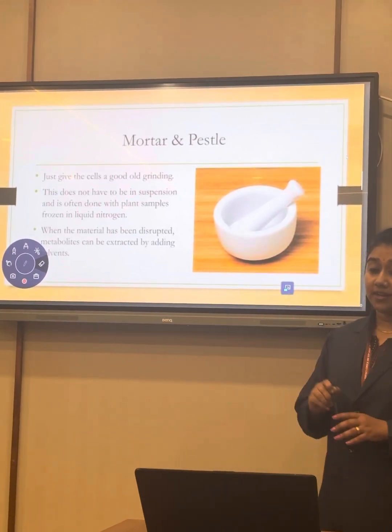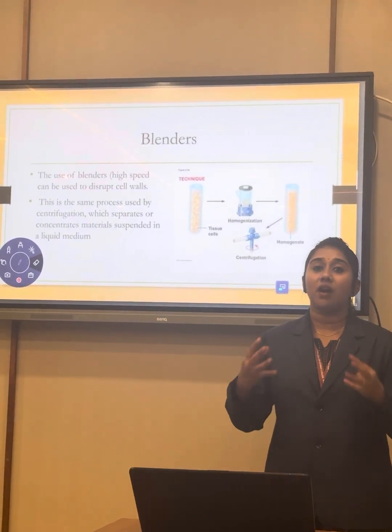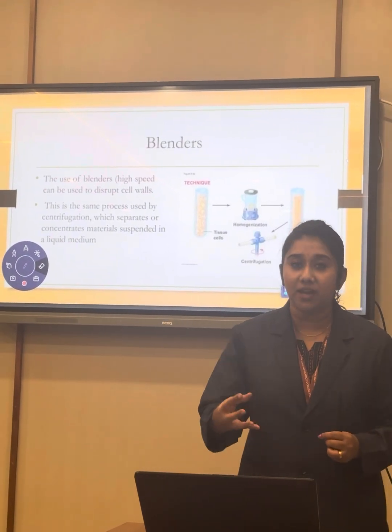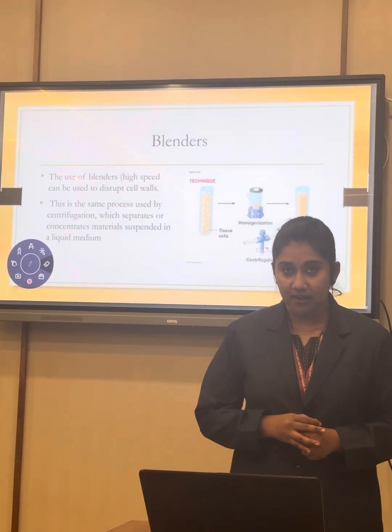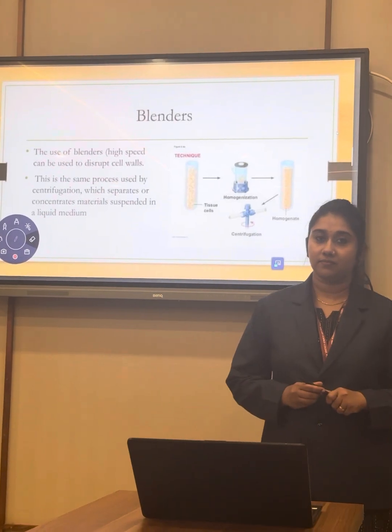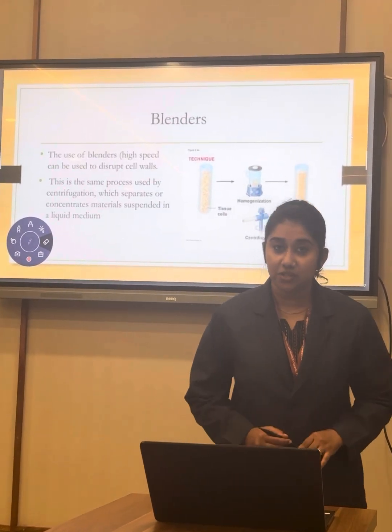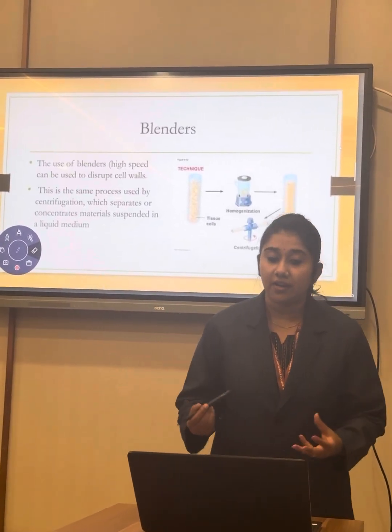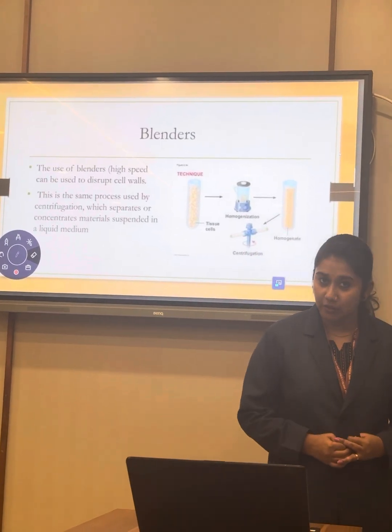Okay, next we are discussing blenders. Blenders means we are using high speeds to disrupt the cells for obtaining some intracellular protein. It is almost similar to centrifugation. Centrifugation means we are separating some concentrated materials from the liquid medium.